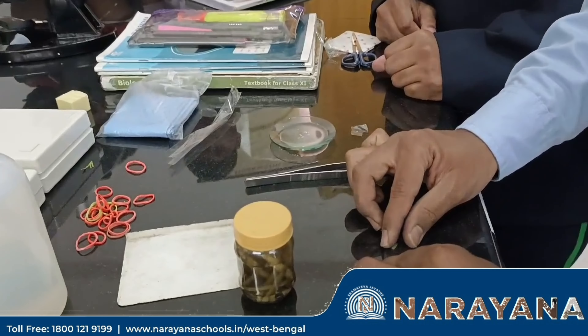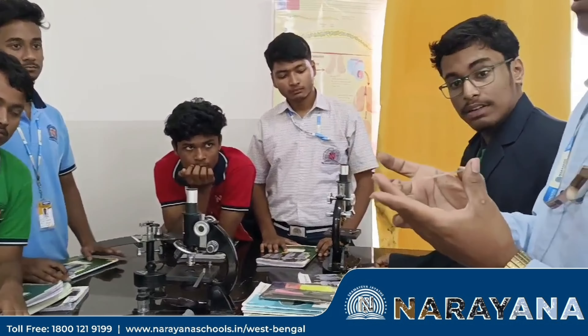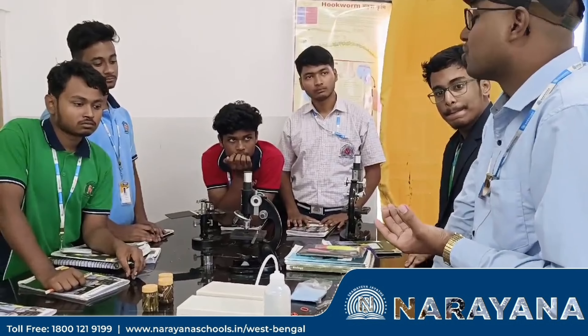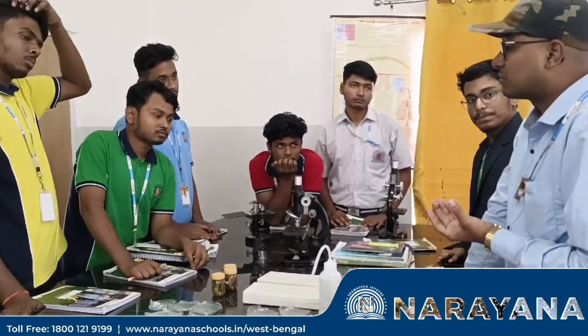After keeping these things, our temporary mounted slide is ready. Now you have to observe under the microscope. We have to put some stain, but unfortunately the stain is not there, so without stain we have to observe.